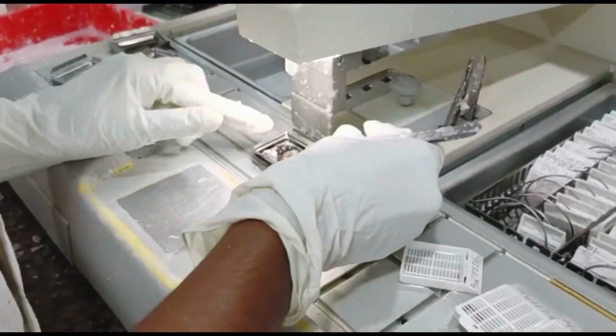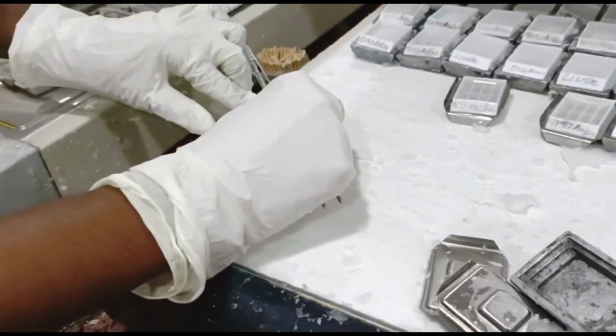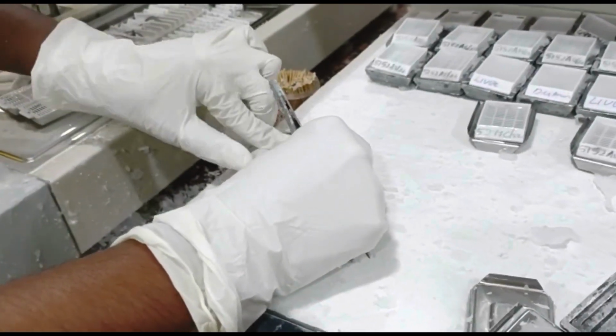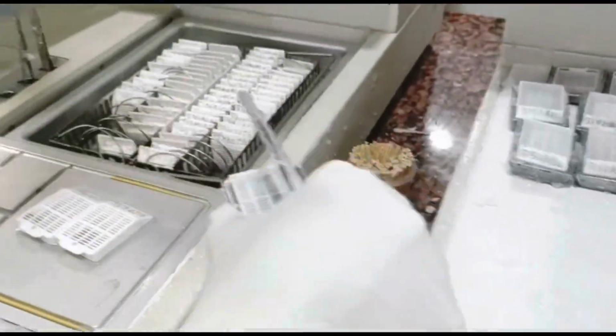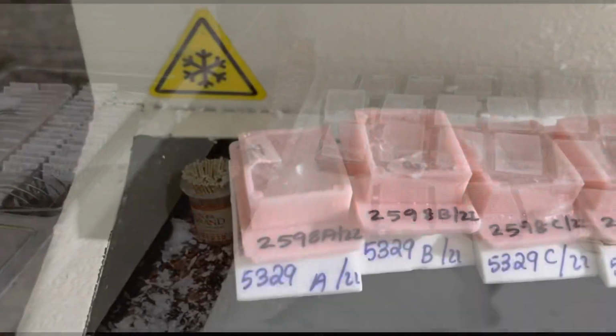The next step is embedding. In embedding, we use L molds, which are customizable molds. The wax is poured and the tissue is embedded along with the number tag. The wax is allowed to harden and form a block. The tissue should be placed with their cutting surfaces down on the mold. Once done, these are placed on embedding trays.